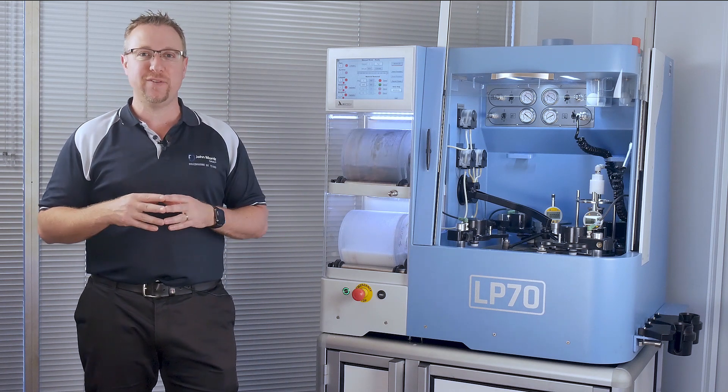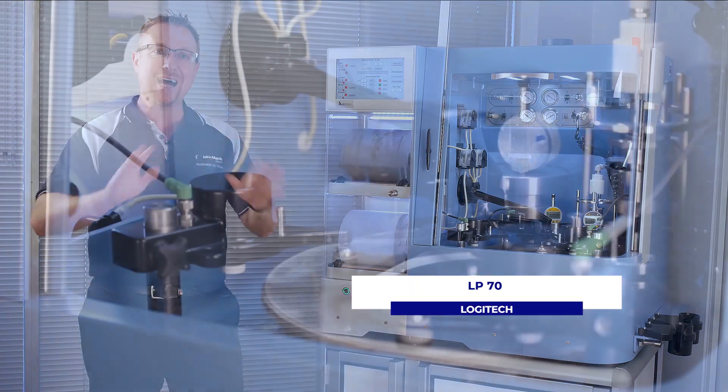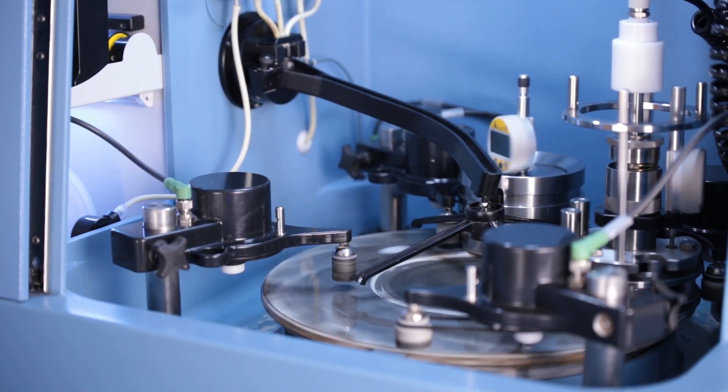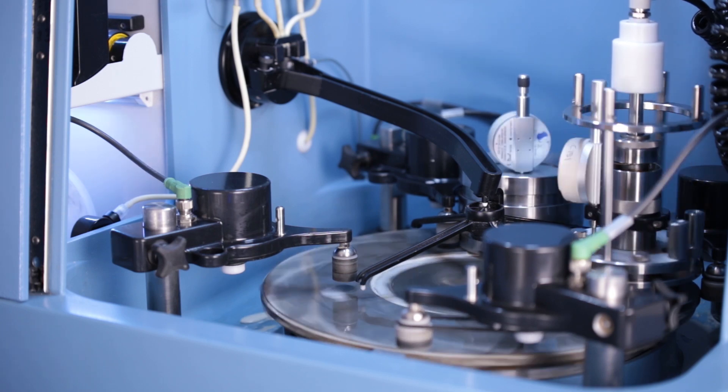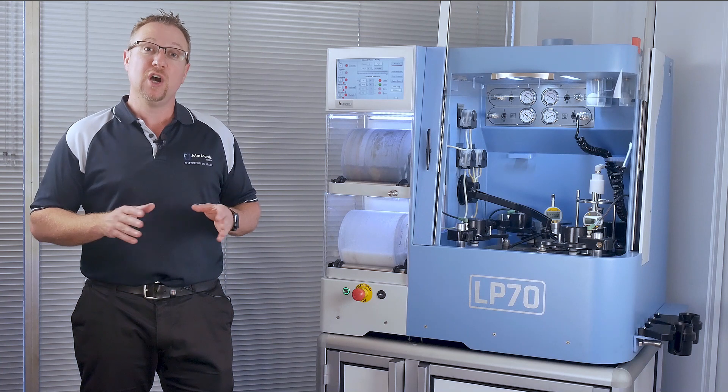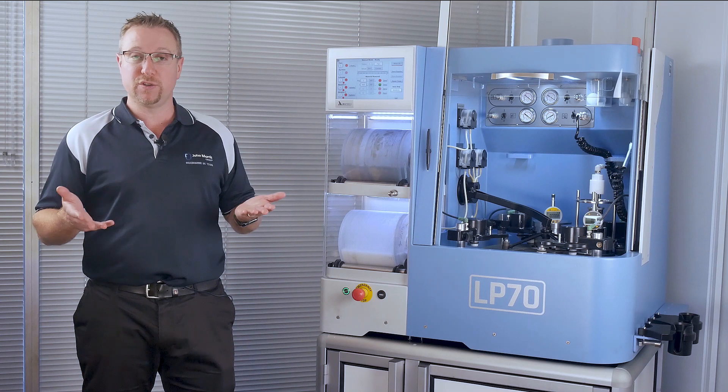But today we're looking at the LP70 system. This new and exciting product quite simply delivers class-leading results in the field of lapping and polishing. The ultra-thin samples will give clear images of the individual minerals, and together with optional vacuum impregnation techniques which can be coloured for such applications as porosity for oil or mineral deposits.